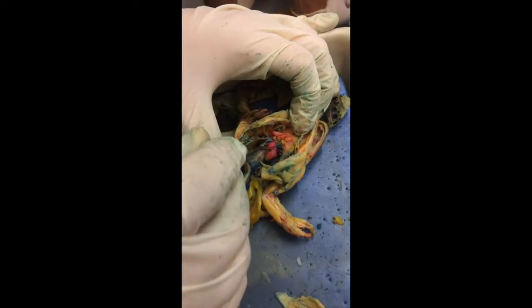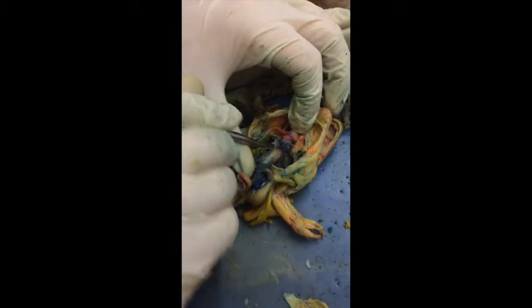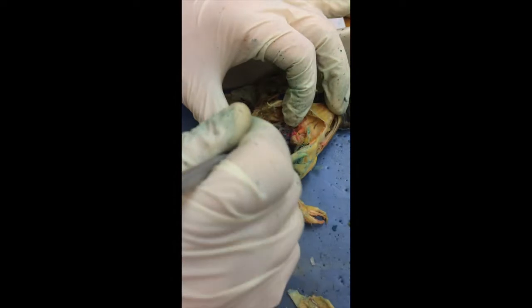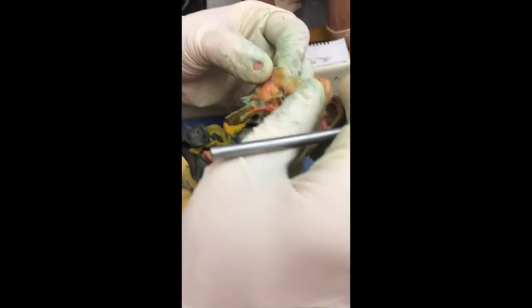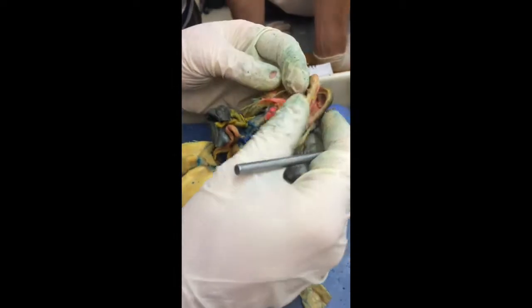That's very embarrassing. You can't see in the video. Okay, can you point it out? Heart, lungs, the brown sac here and here, and the esophagus. Classic mix-up. We are going to ask for not latex injected next time, because this is just a mess. It does look veiny. The esophagus is huge.